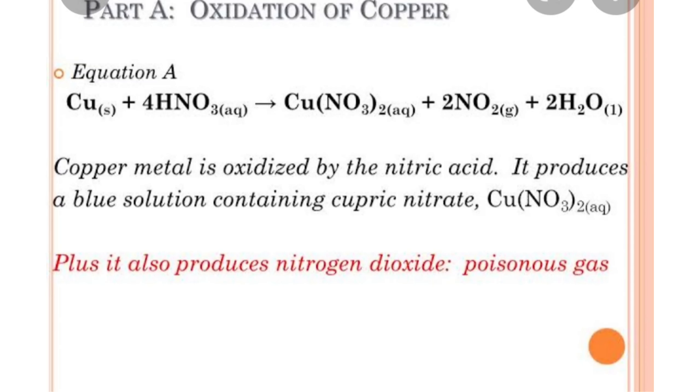Guys, you can see the reaction when copper metal reacts with concentrated nitric acid solution. There is a formation of the products.